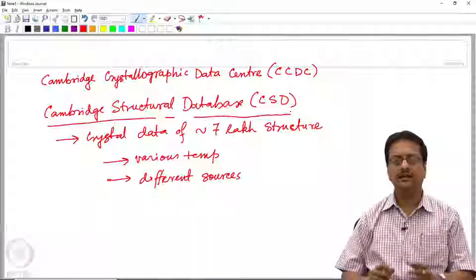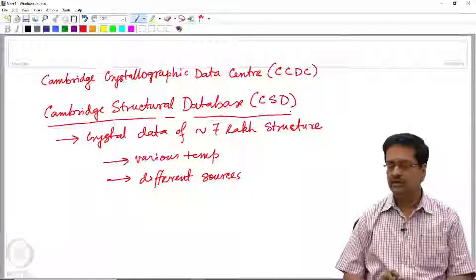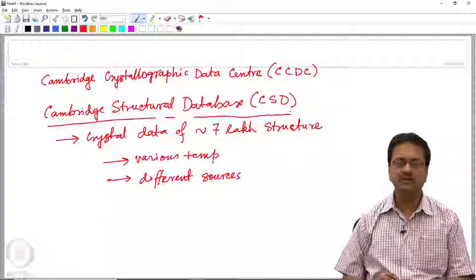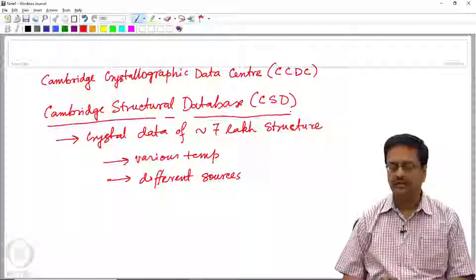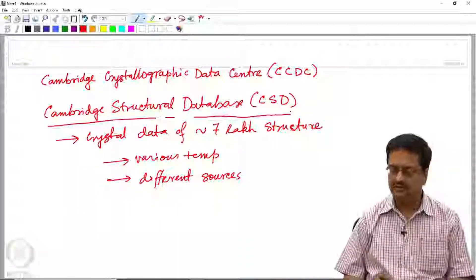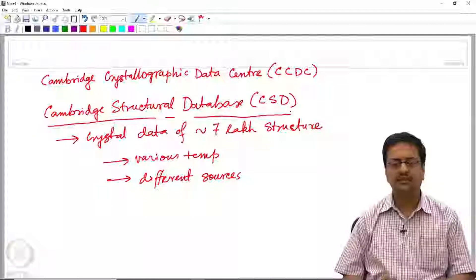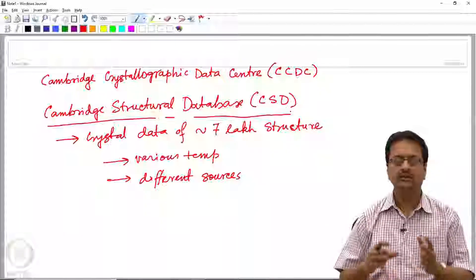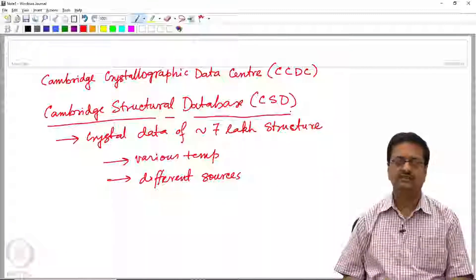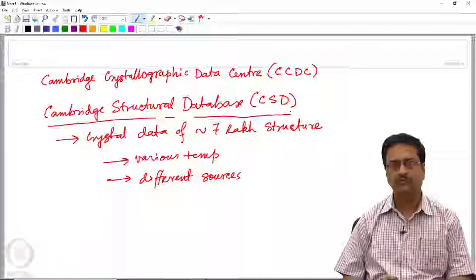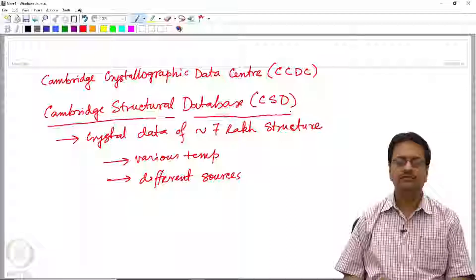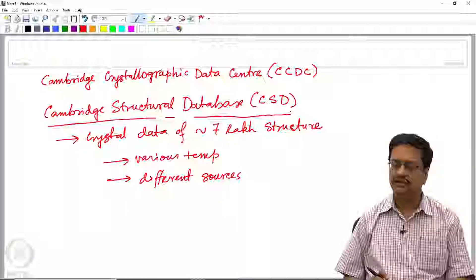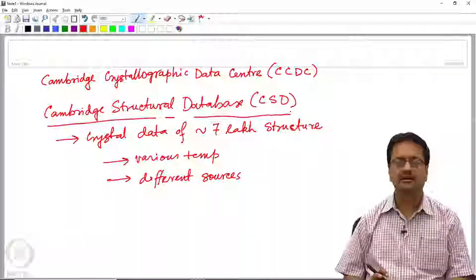Using the Cambridge Structural Database, one can see what structures are reported. Suppose one wants to make a particular type of molecule and wants to know whether the crystal structure of that molecule is already known — we can find out. If somebody wants to explore the possibility of opening a new research wing targeting a particular structural type or compound, one can look for how reported structures relate to that particular compound.